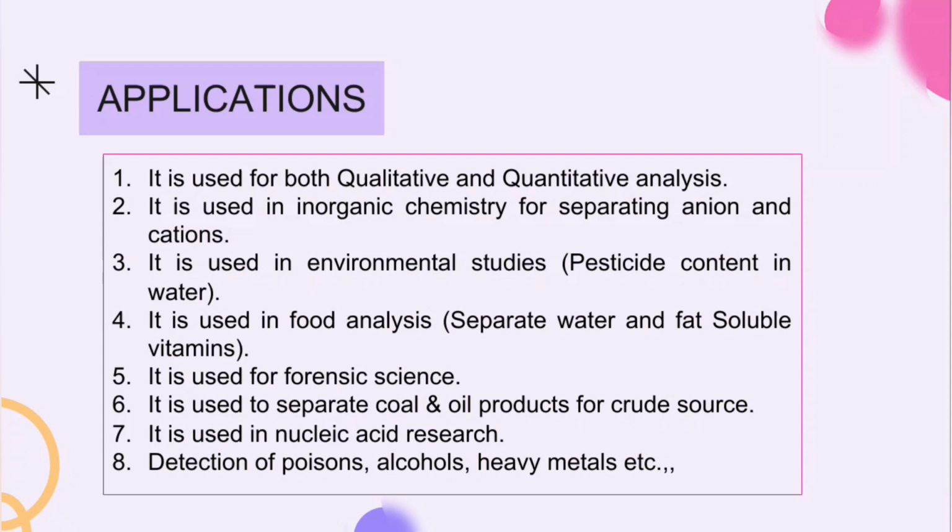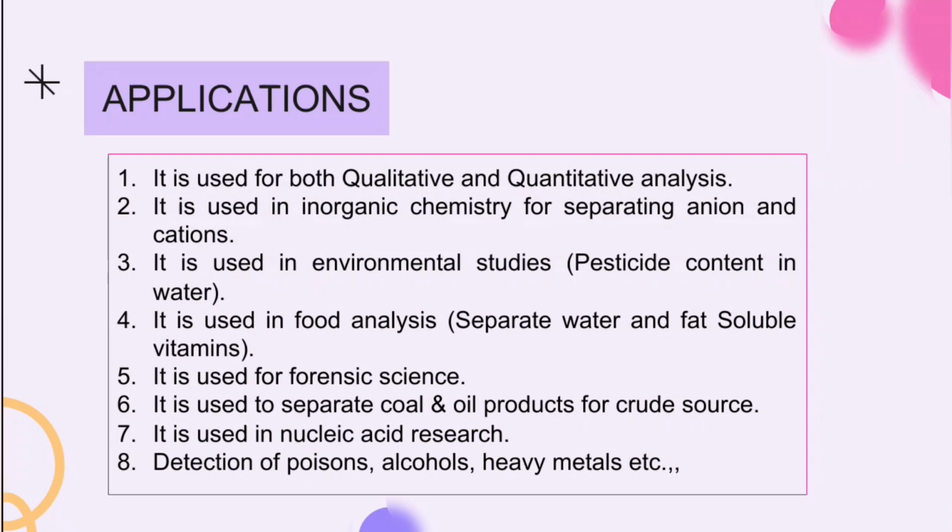It is also used in organochemical industries, and also for various components of plant products, like analysis of cinchona, digitalis, ergot, etc. And it is also used to separate coal and oil products from crude source, and it is used in nucleic acid research.